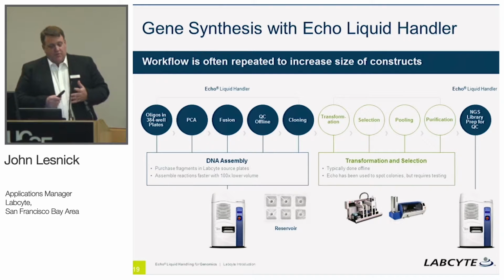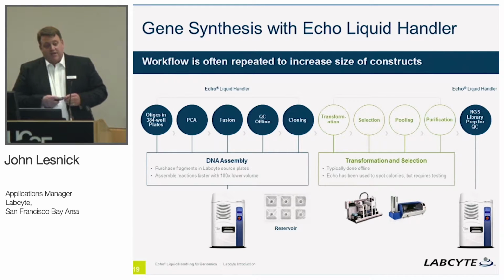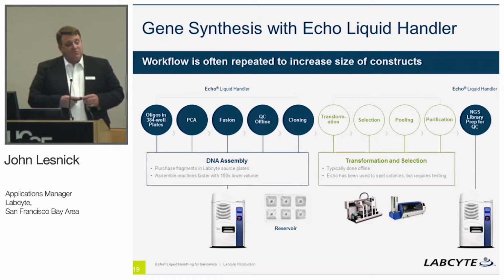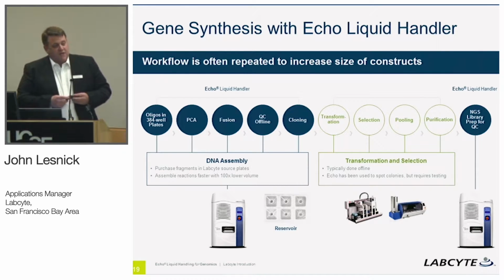This can be bacteria or into mammalian cells. Offline, you're going to be pretty much running your transformation of bacteria, growth, isolation, et cetera, and then you can come back and confirm what you've built in your synthetic biology platform, looking at an NGS library prep.